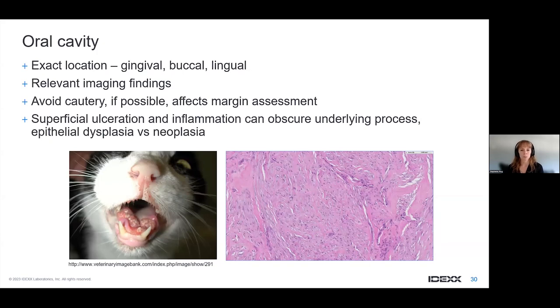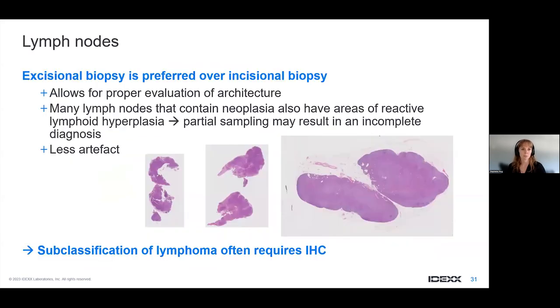If you submit a biopsy and you're really concerned about a really aggressive clinical lesion, and then it comes back with reactive tissue, and it just doesn't match what you're thinking, it is really helpful to just give us a call and say, look, the histology results don't really match with what my concern is. Can you have another look? Can we discuss? That's really helpful.